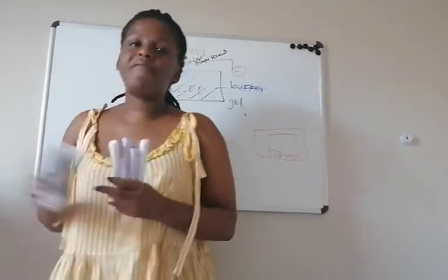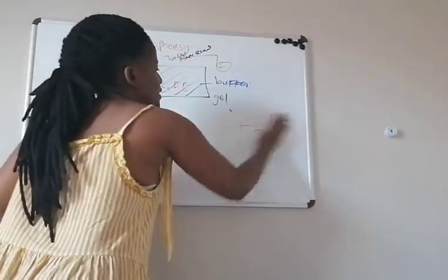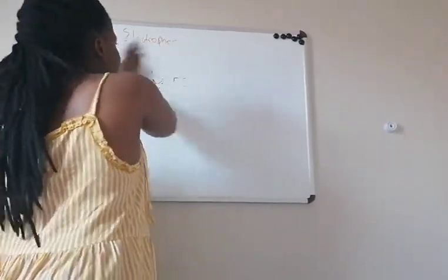But then there are factors that will influence this migration of particles.